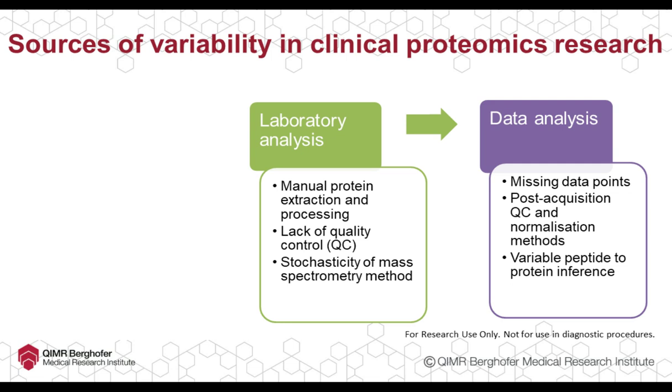In the laboratory and data analysis aspect, again, there are many steps which can cause variability during the sample processing. And so here, one must really minimize this technical variability.